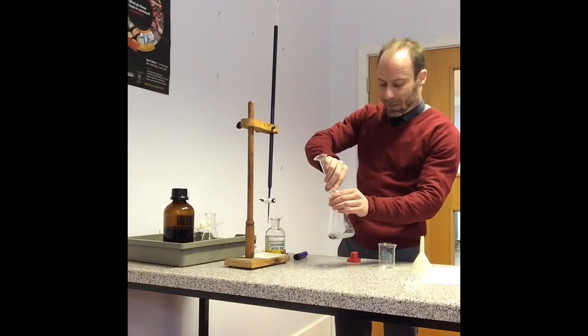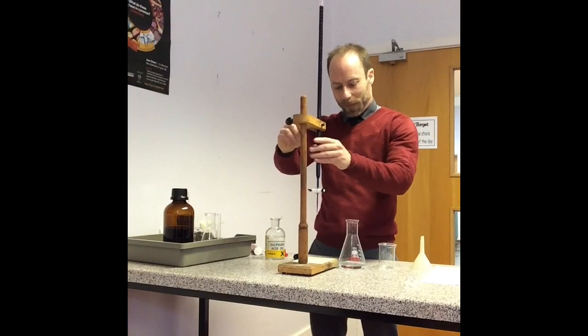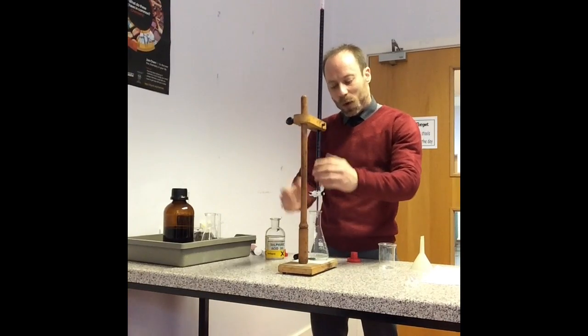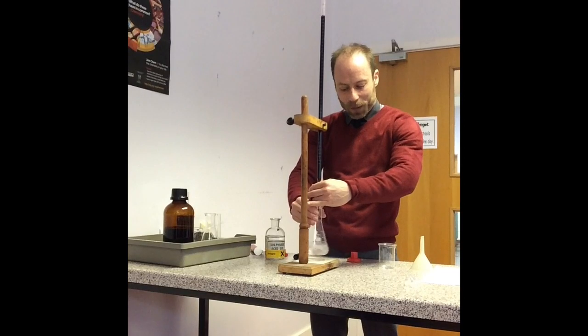In it goes, sorted. Okay, so I'm now ready to go. Are we looking for a colour change? Yeah, so what will happen as I add it, can you see that the purple colour is disappearing? Yeah, so until it comes up. I'm going to add it, and the end point will be when that purple colour remains. It doesn't disappear straight away.